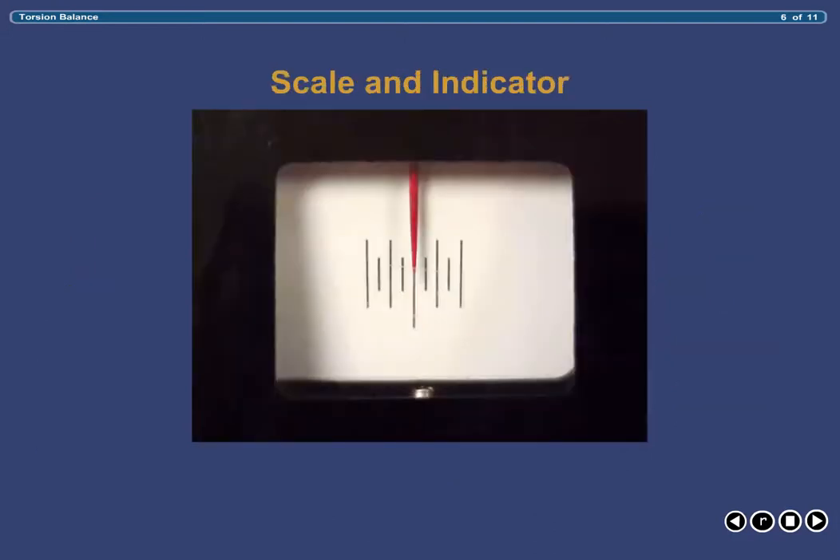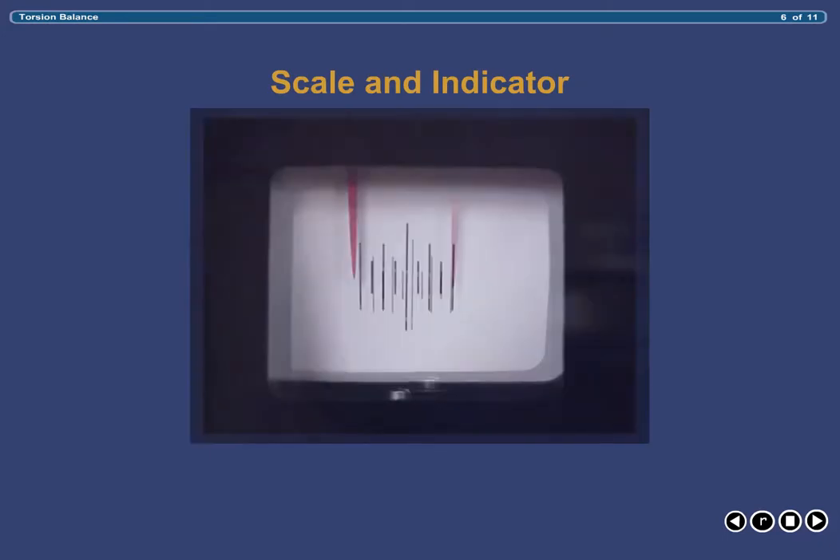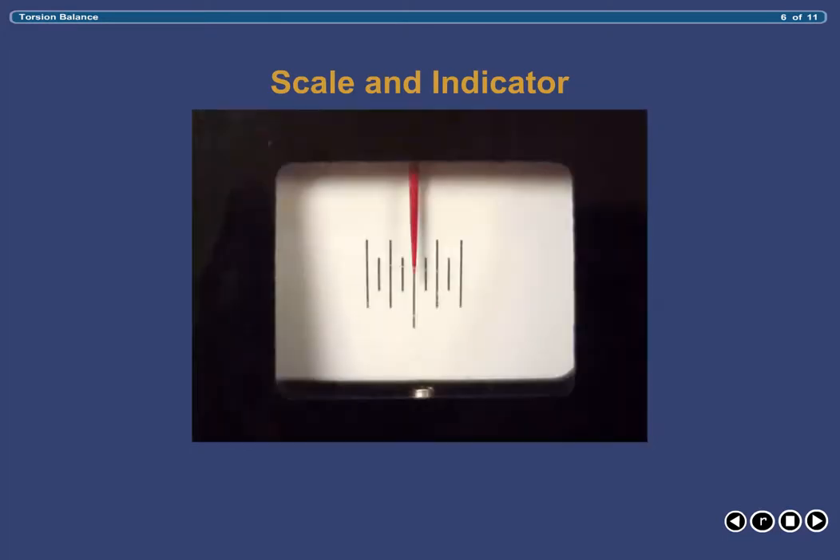The scale and indicator can be visualized through a window located on the top surface of the balance in the center. The scale contains long vertical markings in the center, flanked on either side by smaller markings, which reflects the balance's sensitivity. The scale and its markings remain stationary at all times. The indicator, otherwise known as the pointer, is bright red in color and can shift to the right or left during weighing. Sustained alignment of the pointer with the long central vertical marking indicates that the weight in each pan is equivalent.